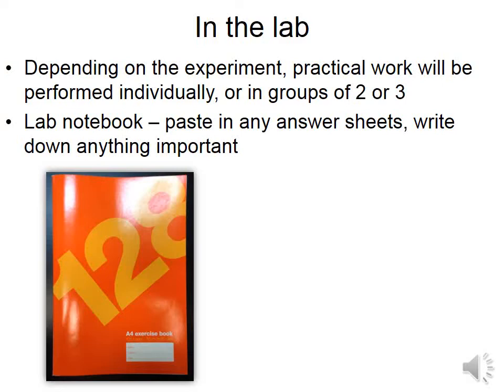You will be given a lab notebook that looks like this. You must record all your data in the notebook, including pasting results sheets or printed spectra, and write down anything that is important. If you want to query a mark or ask a question, you must bring your notebook with you so that we can check what you actually did in the lab.